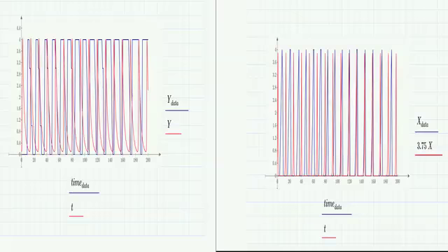the oscillating fit peaks. To achieve the best fit, the theoretical values for X were multiplied by a coefficient of 3.75 to achieve the proper amplitude that matches the experimental data.